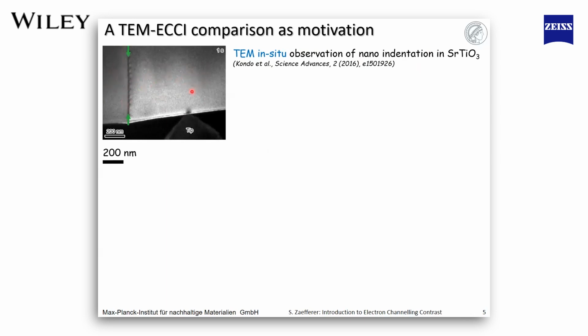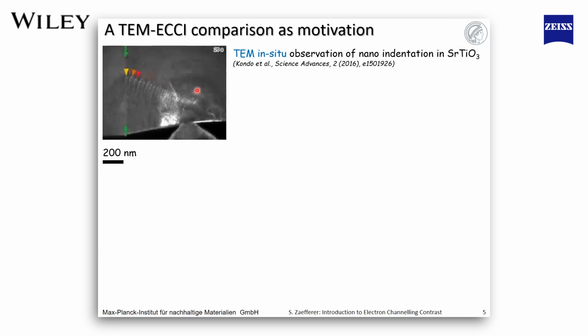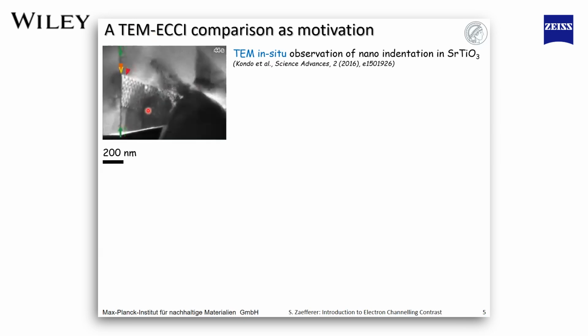They are nicely thinned. And then here at the side, you see an indenter tip placed right on the edge of that thin foil. And when the force on the indenter is increased, you see dislocations are created. With increasing force, these dislocations become denser and denser and pile up in front of this grain boundary. And at one moment, we get a so-called pop-in event. That means that suddenly the indenter pops into the material, creates a lot of dislocations in its surrounding, and we see dislocations even being created in the second grain, on the other side of the grain boundary.